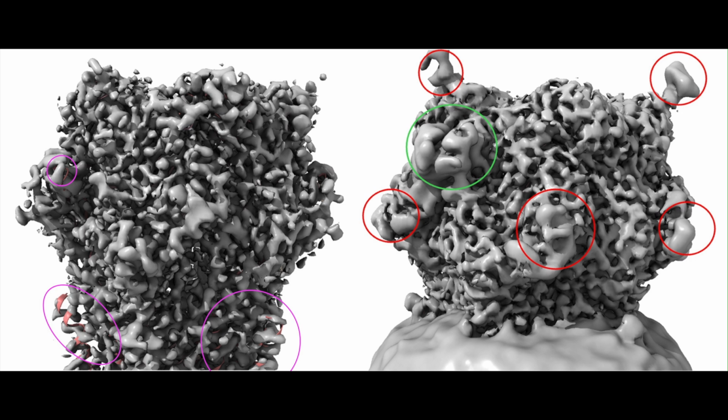But looking more at this picture, what you can see is there's two different density thresholds that we're looking at. On the left is a really high density EM threshold. What that basically means is that on the left, this is where there's a higher density of electron scattering events, whereas on the right, we're looking at a lower density EM density map, meaning that there's fewer electron scattering events there because, among other things, there's a lot more motion in these areas.